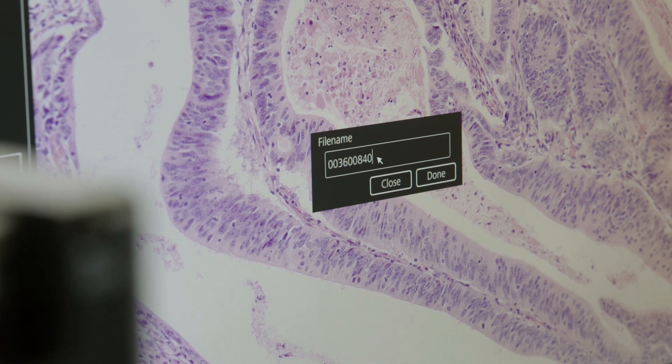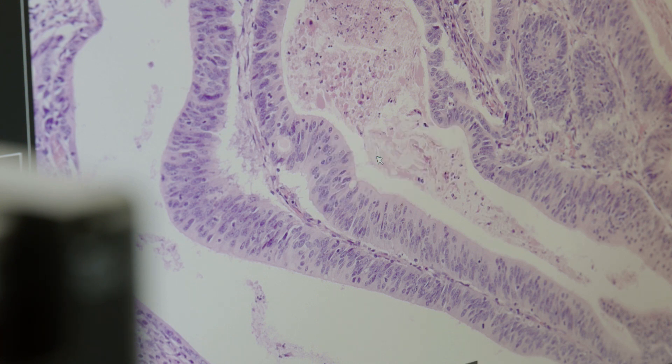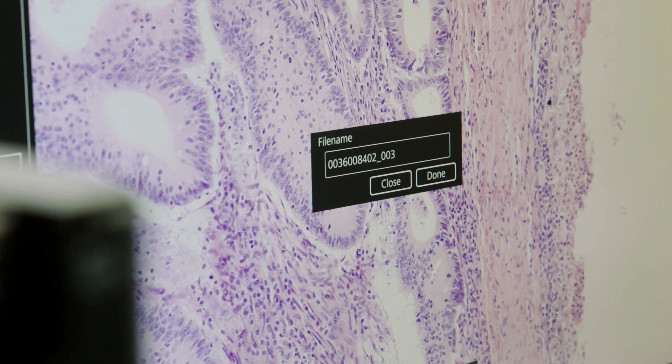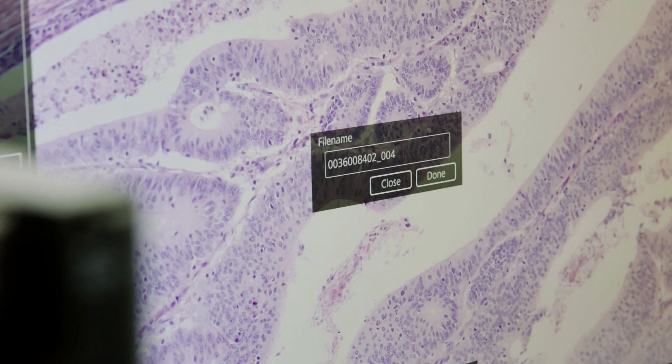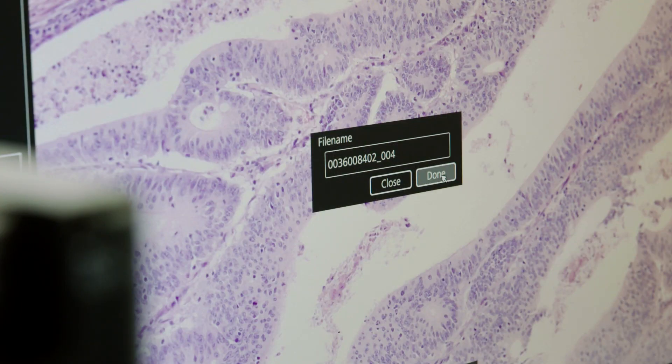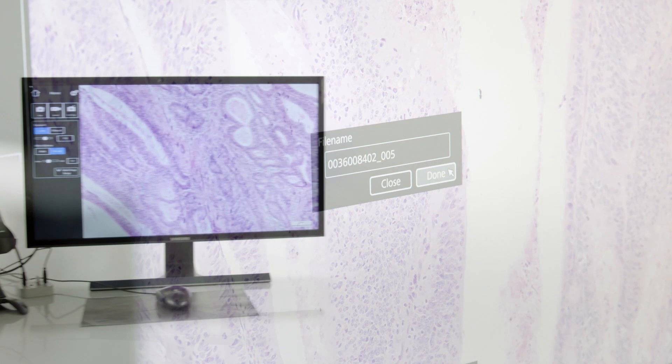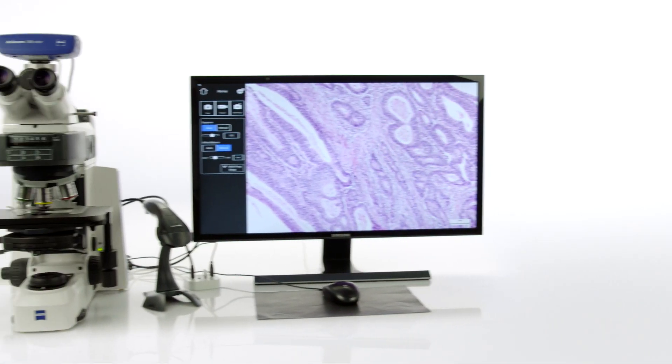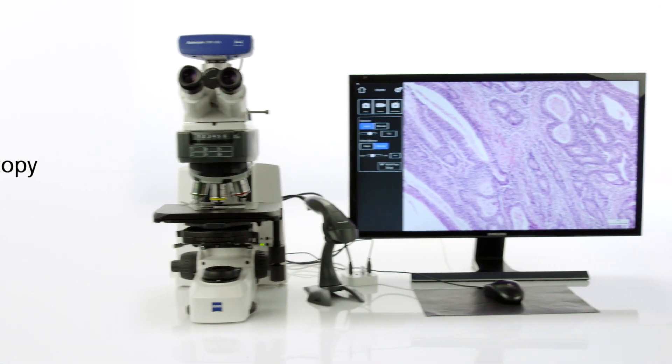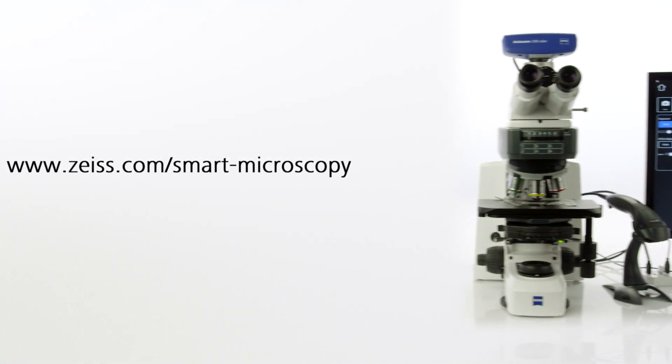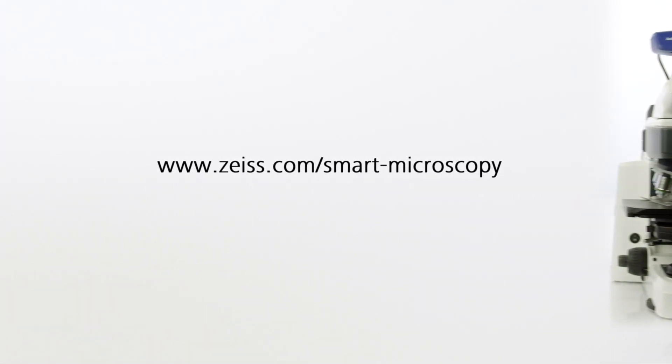It's easy and completely dependable. And if you're taking multiple images of one sample, the file name with the barcode ID will be extended automatically with a counter unless you scan a new barcode. For further information, visit our website.